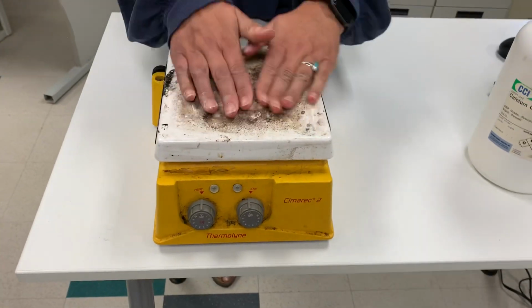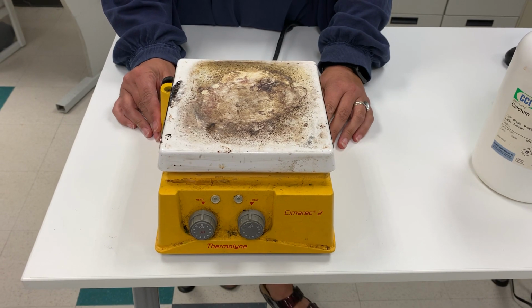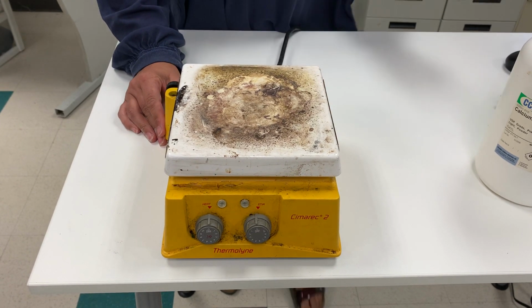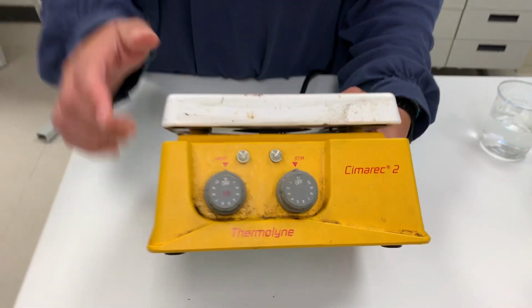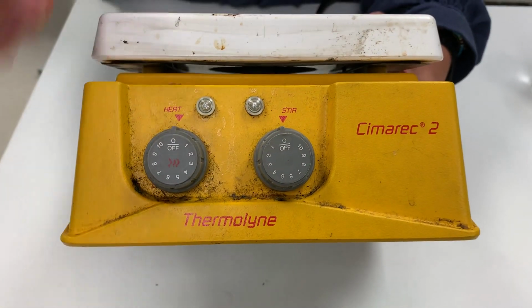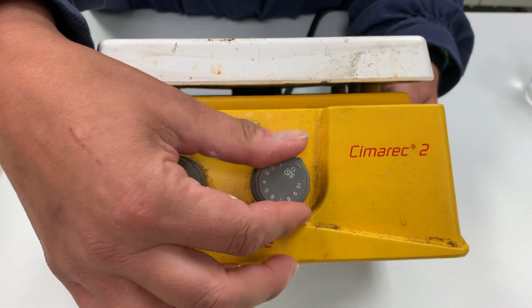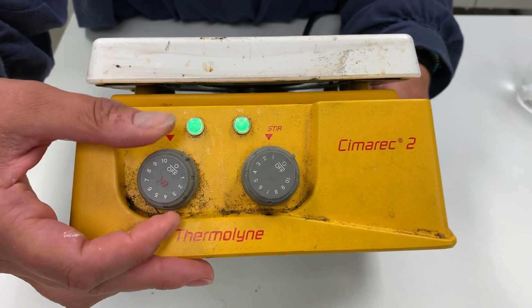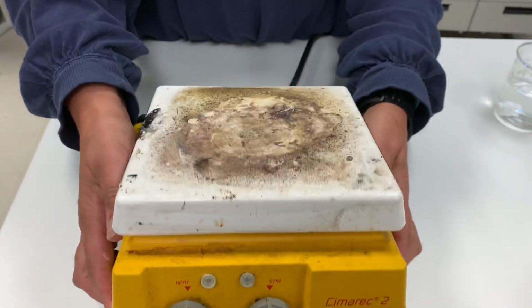The final piece of equipment I want you to look at is called a hot plate. This hot plate has a porcelain top and it looks like it's dirty. It's not. It's just well loved and used and stained over the years. You have to realize that our hot plates are special because they have two knobs, heat and stir. You can just heat, you can just stir, or you can heat and stir at the same time. But before you plug this in, make sure they're both off.